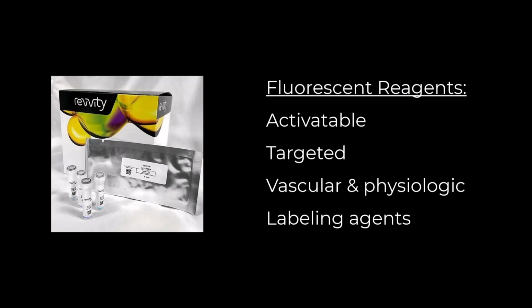Here, we'll focus on in vitro validation of Revity's near-infrared fluorescence imaging agents and dyes that are designed to explore a variety of functional and molecular readouts underlying disease. These imaging agents fall into four major categories.